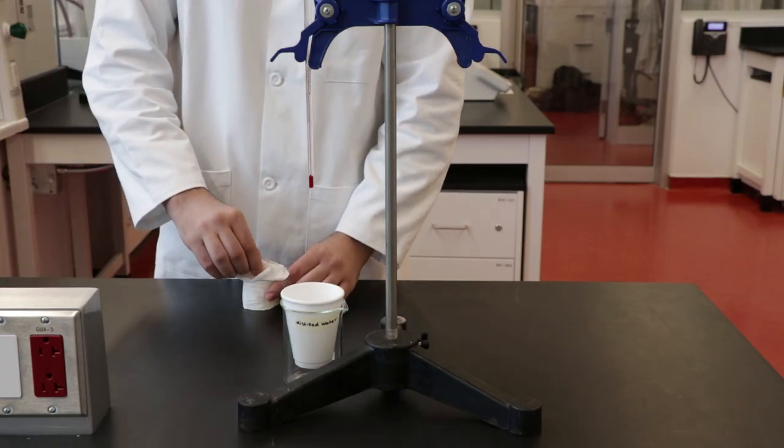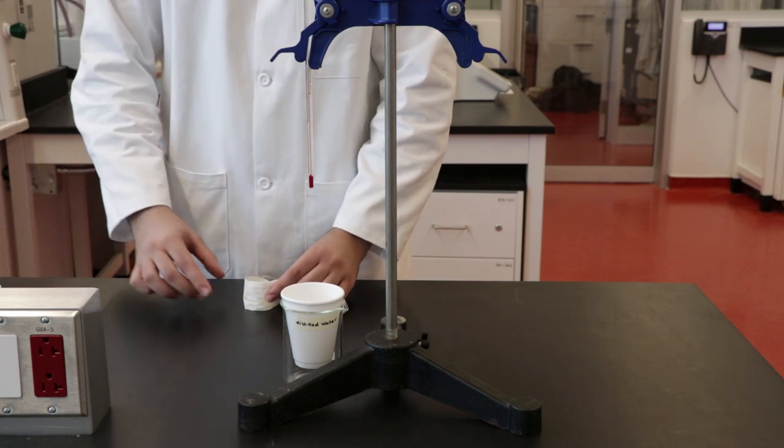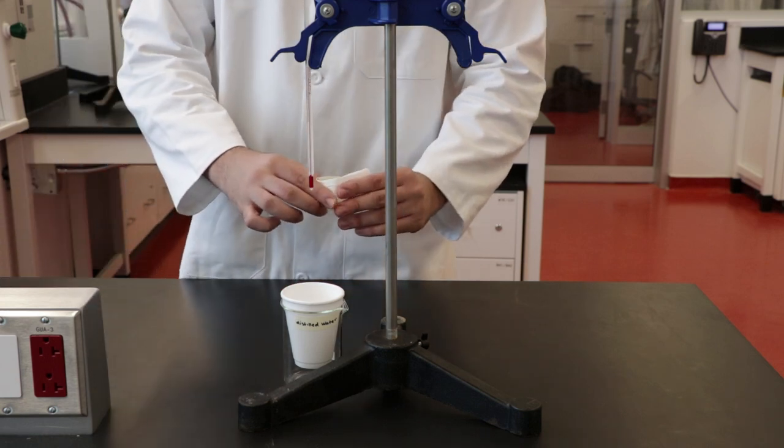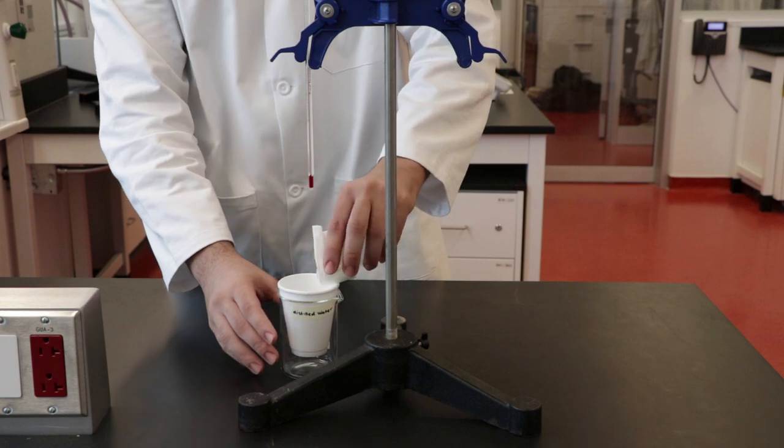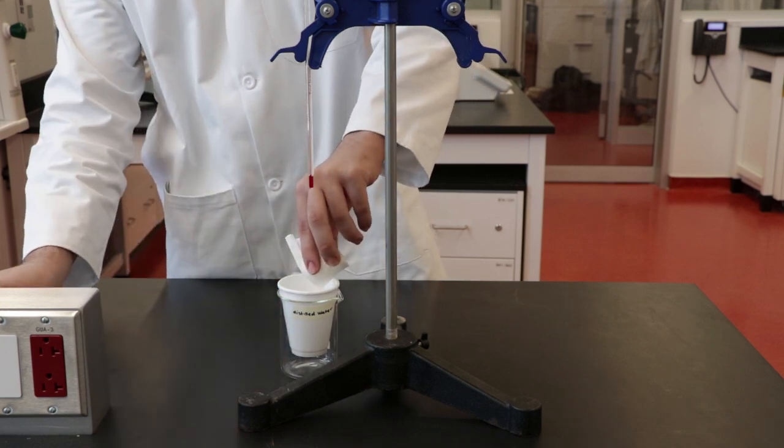At the five minute mark, pour the contents from the weighing bottle into the styrofoam cup and stir using a glass rod. Use kim wipes when handling the weighing bottle.